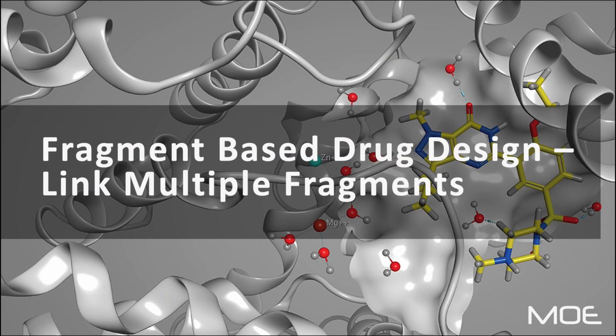Today I'd like to demonstrate the fragment-based drug design tools that we have in MOE. In today's session we're going to be taking separate fragments that occupy different parts of the same pocket, and then we'll search for a linker so that we can create a single small molecule ligand. A typical starting point for this workflow would be the results of a fragment screen or perhaps crystallographic fragments. So let's get started.